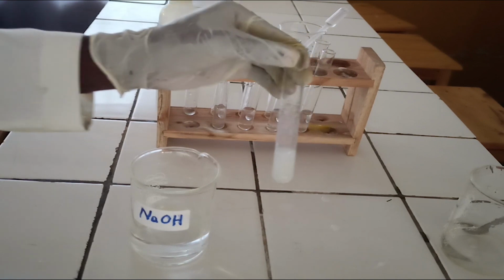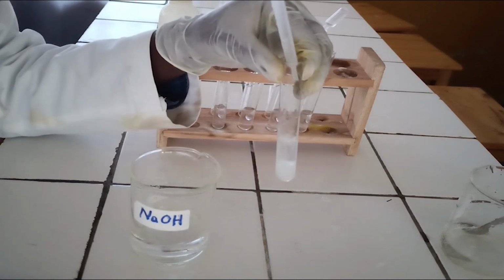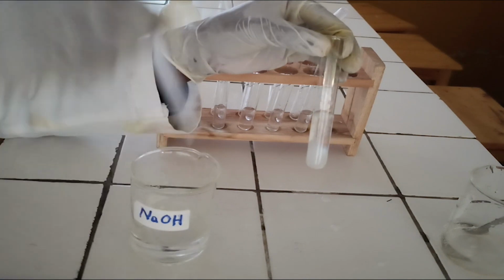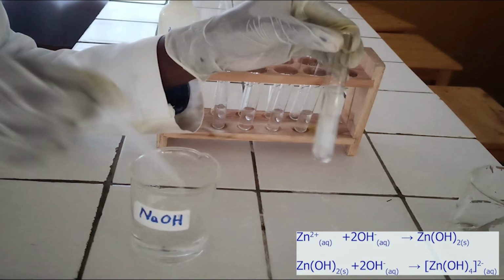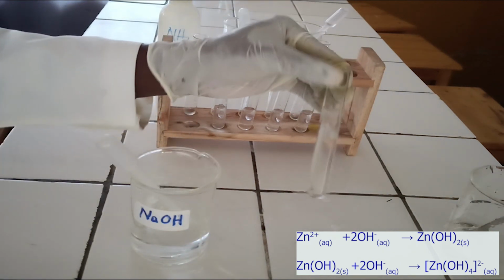As you see, sodium hydroxide reacts with zinc ion to form white precipitate, which is soluble in excess of sodium hydroxide. Below, there is ionic equation for this reaction.